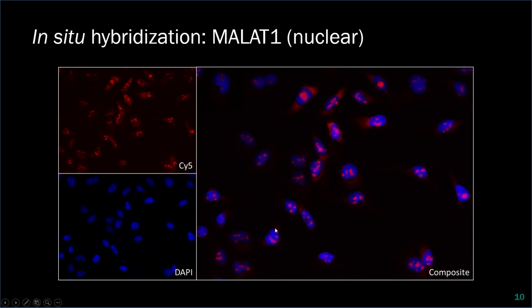In that paper, they have a really nice image that shows, and this is ongoing right now, these are the experiments that I'm actually doing this week, that you have an in situ signal in the nucleus, and then when you treat it with an siRNA, the signal in the nucleus disappears. Whether or not it's being exported out and exported back in, and that's when it occurs, I'm not sure. I don't know the answer to that. It's a very good question, for sure. Yeah, it's a very good question, and it's a question that people are trying to figure out right now.